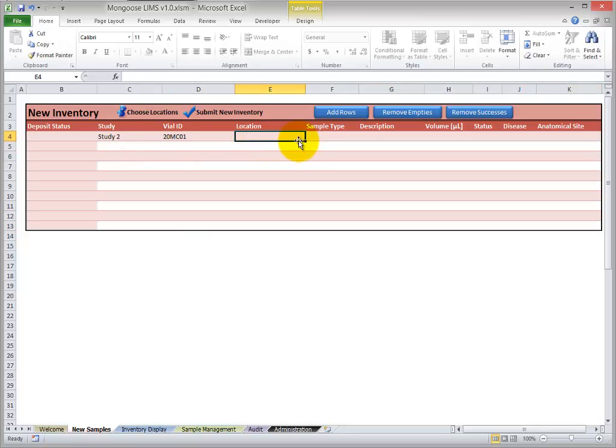For the location, you need to specify the freezer, the shelf, the rack, the box, and the cell into which you'd like the new samples to be placed.